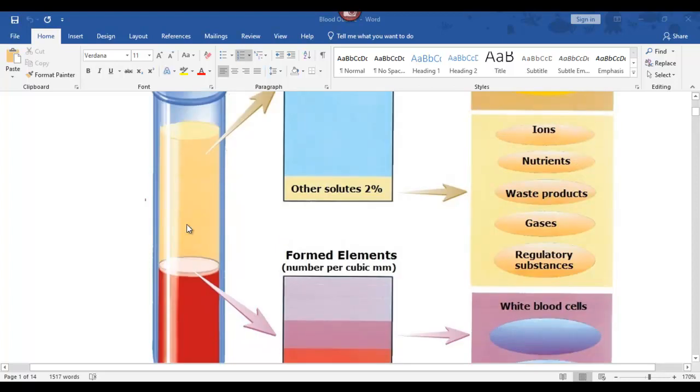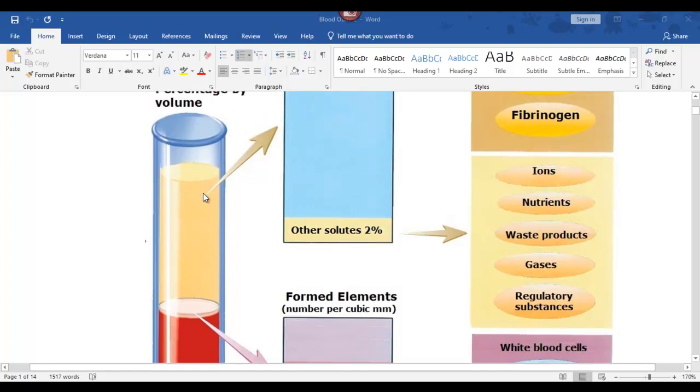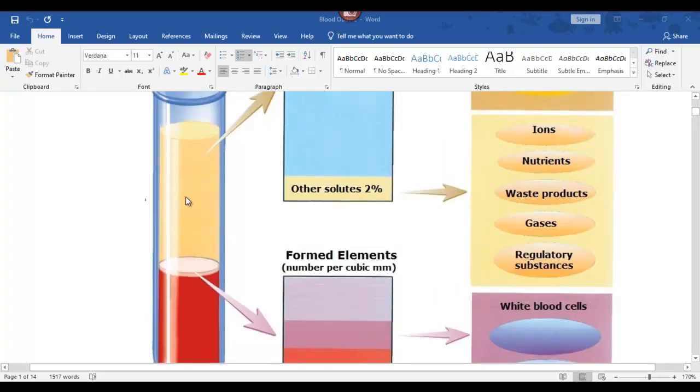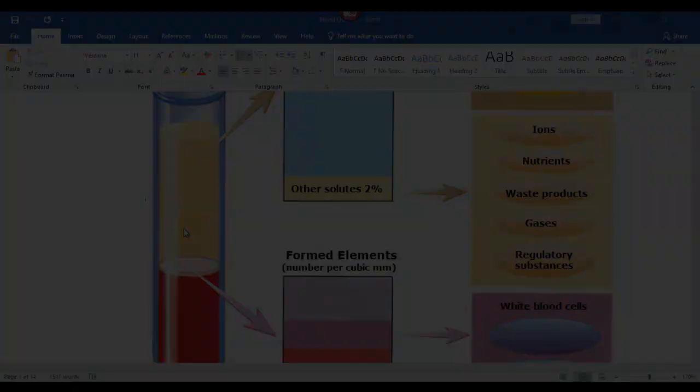If you put blood into a test tube, you can do two things. You can either add some anticoagulants to where the blood will settle on the bottom and not clot, and the plasma ends up on top, or you can centrifuge it, and you can see that next. If you've never seen a centrifuge, this is the picture that is on our first page and it's in our PowerPoint as well. You have blood that is separated.